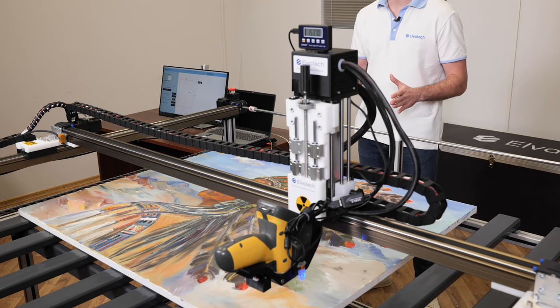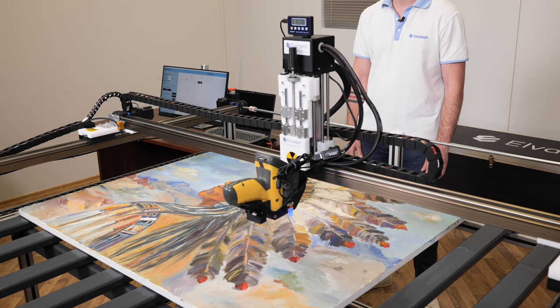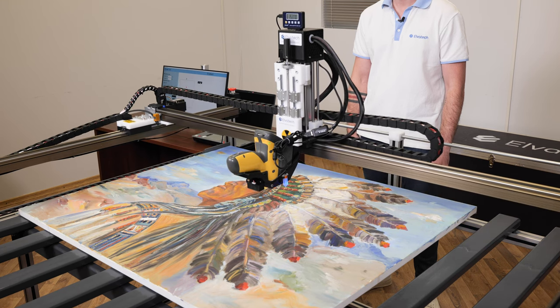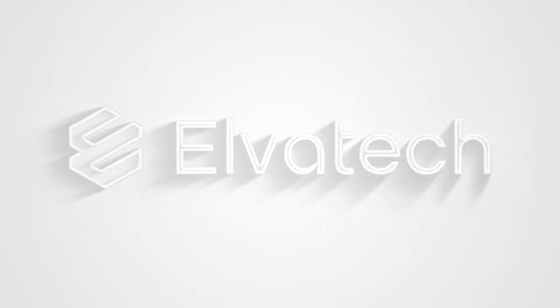Let's now take a closer look at how the Elvox Art operates in practice. Here we place a painting to show you how the device works on the table surface. The first step is to set up the spectrometer and position it right above the area you would like to analyze. Once everything is set up, Elvox Art begins analysis. The entire process is fast and accurate, providing detailed information about the composition of materials used in the painting.